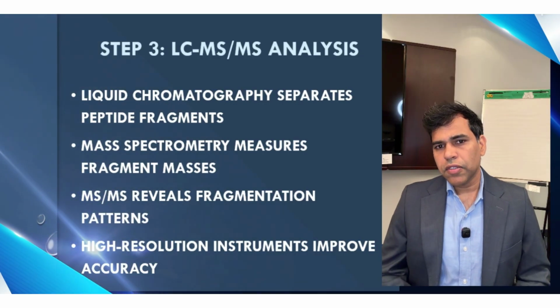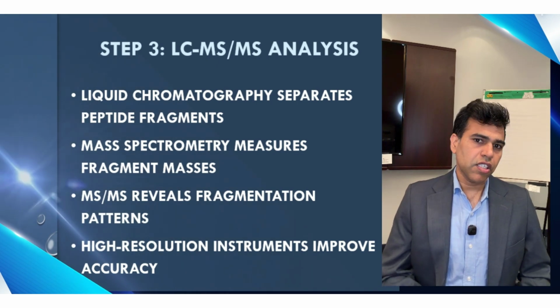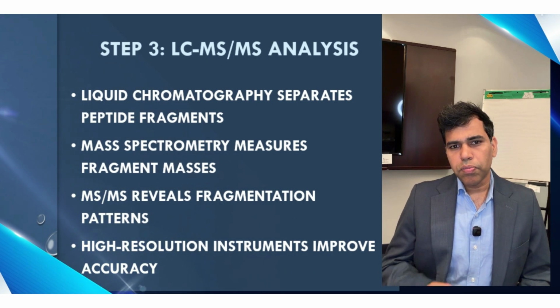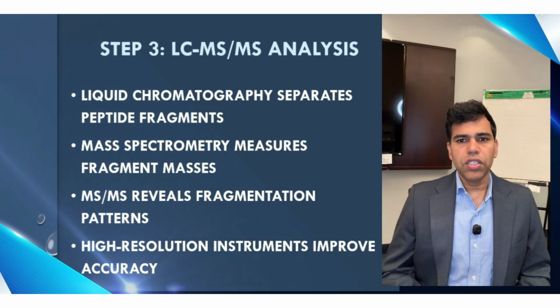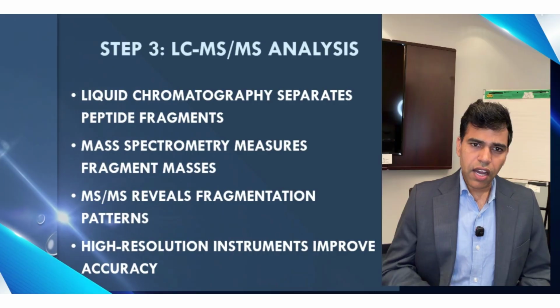Instrument resolution matters here more than most project teams anticipate. Low resolution data gives you masses. High resolution instruments give you confident, defensible identities.